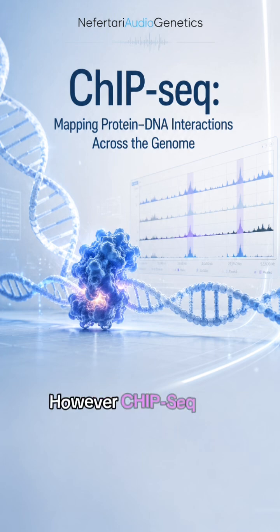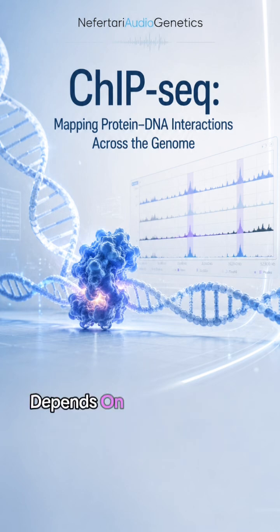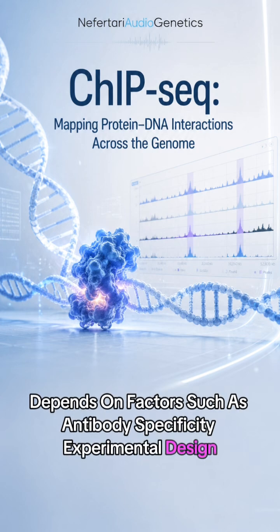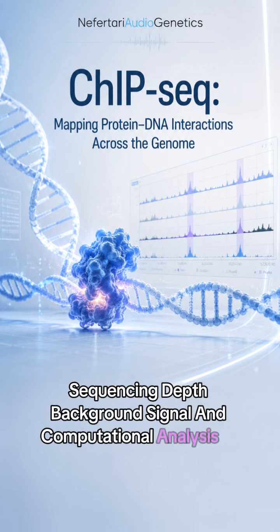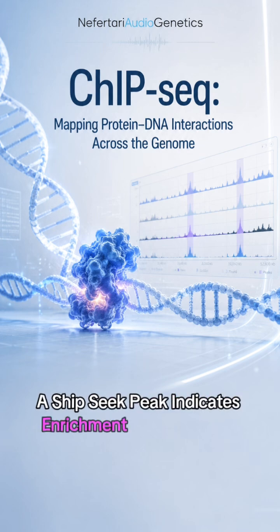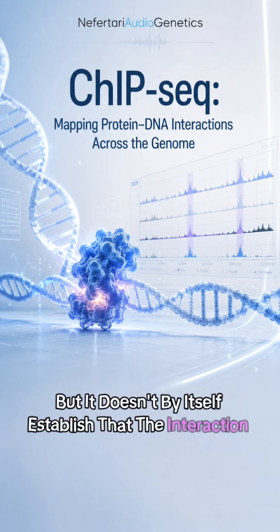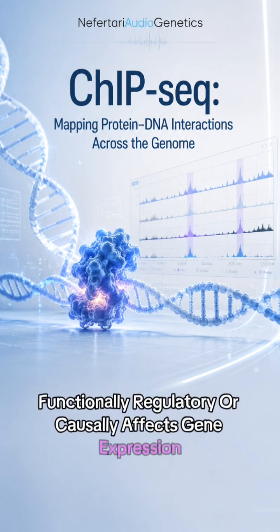However, ChIP-seq has important limitations. Its reliability depends on factors such as antibody specificity, experimental design, sequencing depth, background signal, and computational analysis. In addition, a ChIP-seq peak indicates enrichment at a genomic region, but it doesn't by itself establish that the interaction is functionally regulatory or causally affects gene expression.